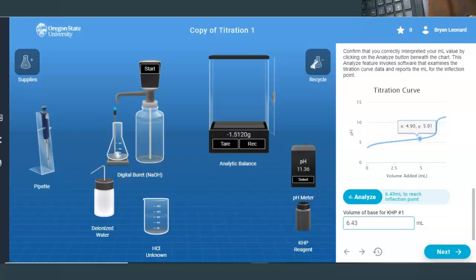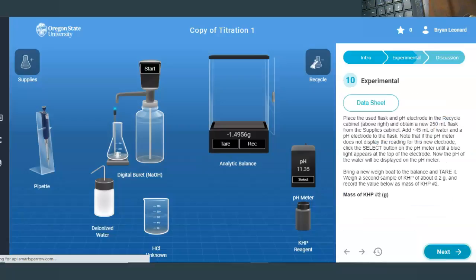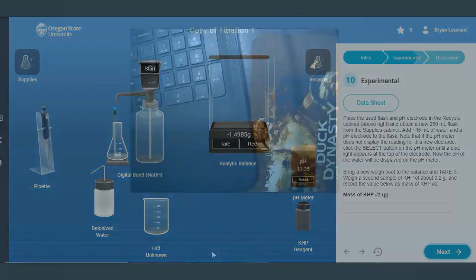And what you can do is you just cursor over until you find it, and right there's 6.40. 6.50, 6.4, so 6.43 is what they're telling us it is, but you just want to pick a point kind of in between there. And so now that I have this one done, let me switch over to the camera.